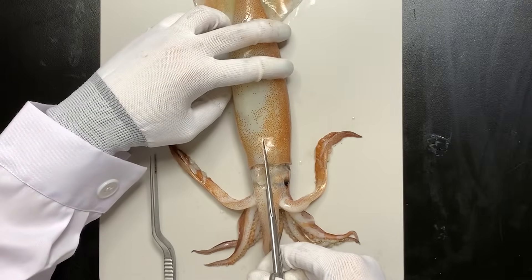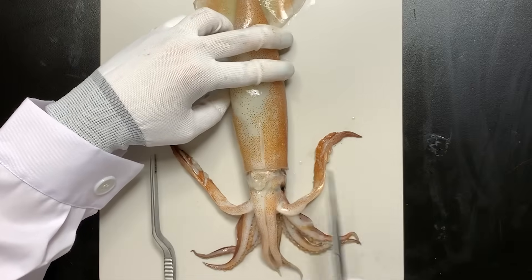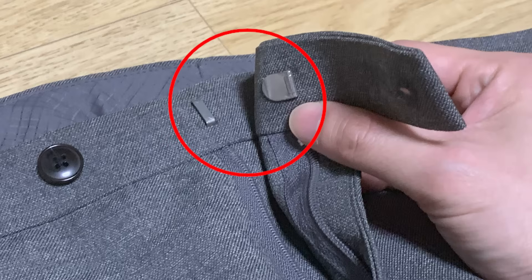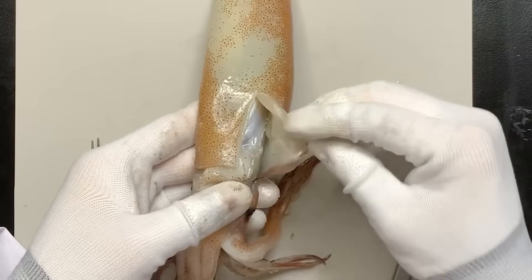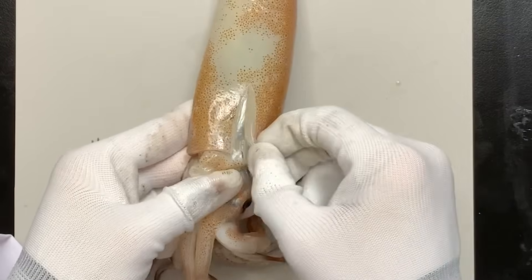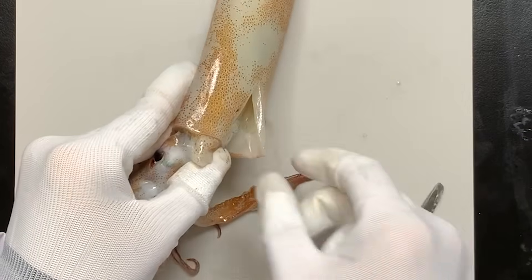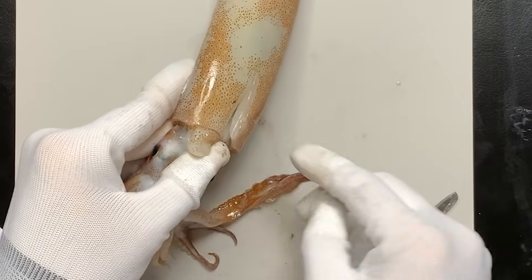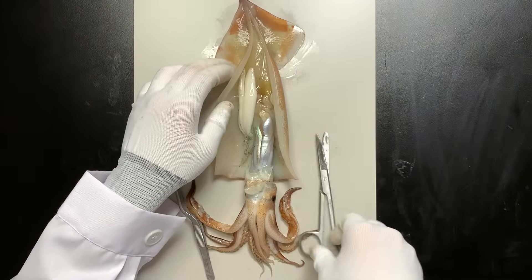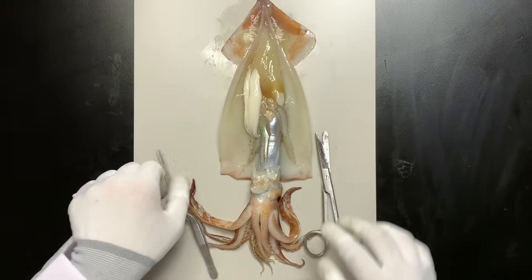Now, let's cut the mantle near the funnel using scissors. Cut a bit and you'll find something interesting. See this part? It looks just like a pants hook. The mantle and head are joined by a hook-like structure — that's why they can fasten and unfasten. When you fully open it, you'll see the internal organs lined up, covered by a clear membrane.